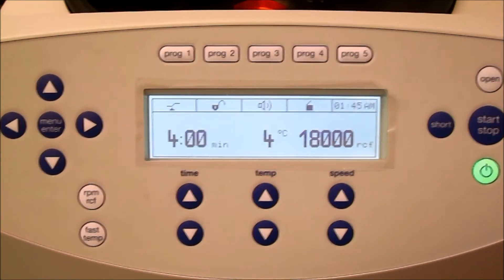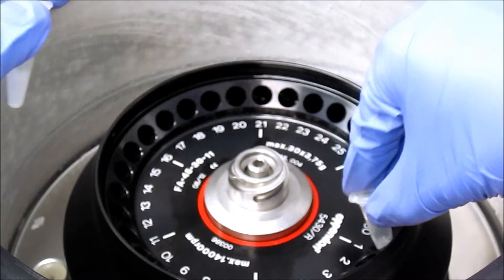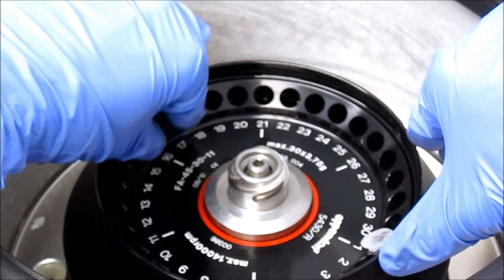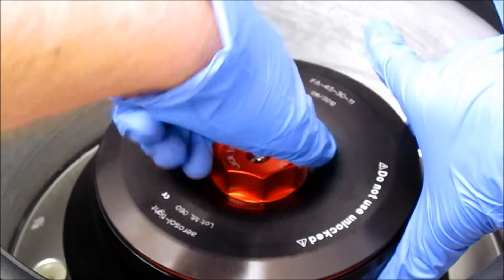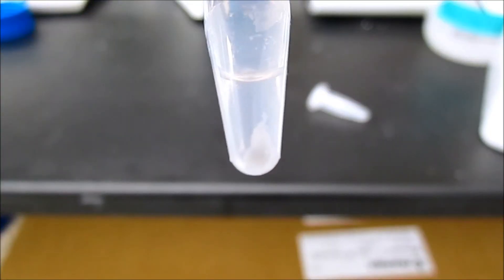After incubation, each sample is centrifuged for 4 minutes at 18,000 G at 4 degrees Celsius. This separates the liposomes from the solution due to their density and causes them to form the pellet seen at the bottom of the tube.